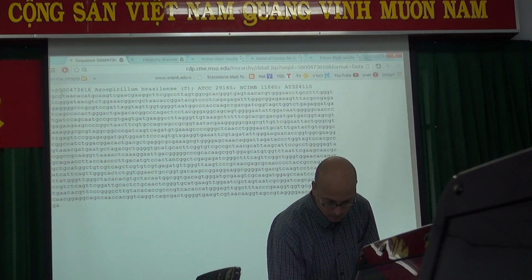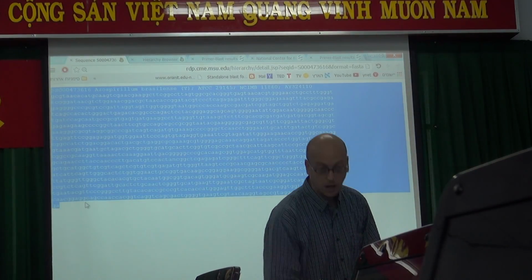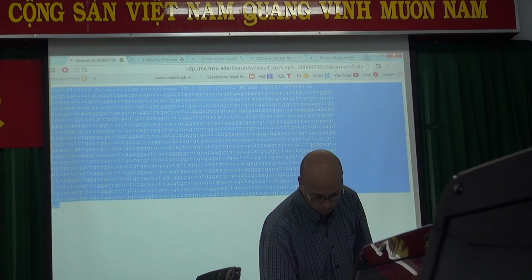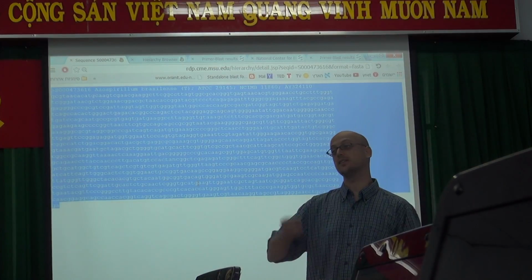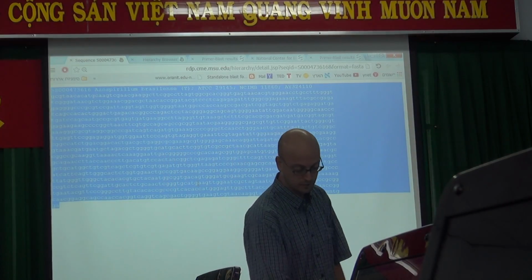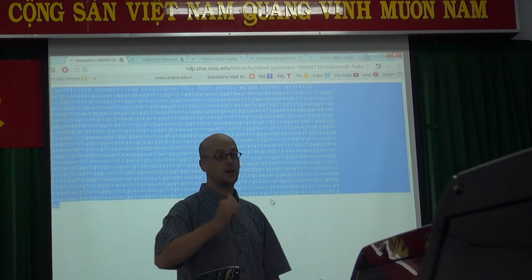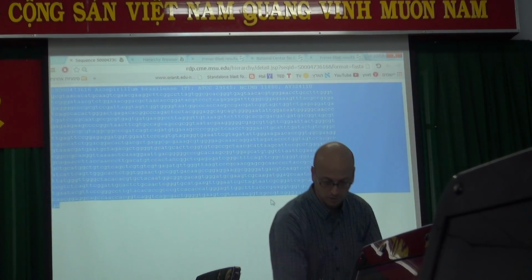This 16S gene is called our template. This is what we are looking for. So, we copy this template. Just copy it. So now we have the template and we go to another place in order to construct the PCR primers.